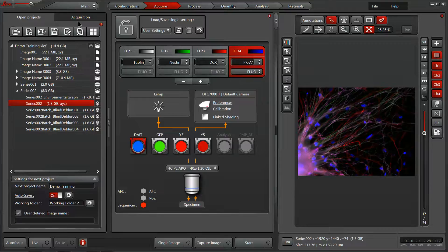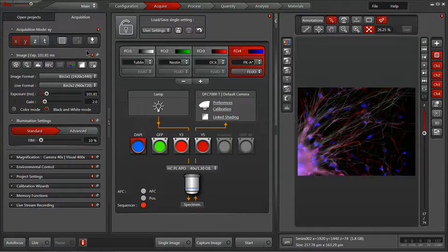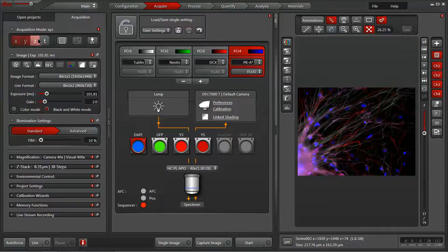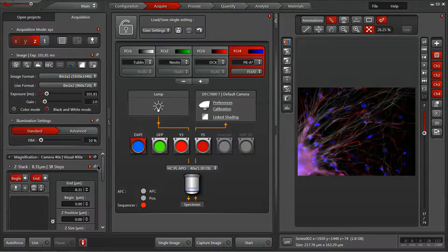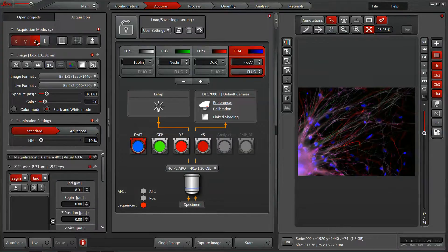Let's continue into our Acquisition tab. The first thing we'll see is the Acquisition mode, where we control which dimensions will be included in our experiment. All the ones that are selected will be highlighted in red. When you add an additional dimension, the new dialog appears in the list below, and you can address that dialog to assure that it's capturing the range within the dimension that you like.